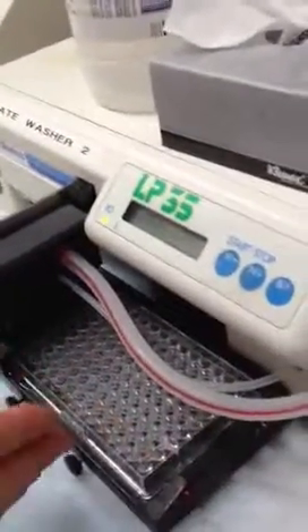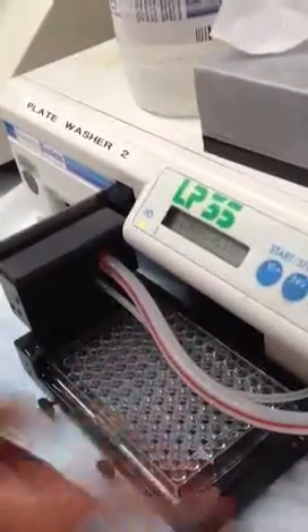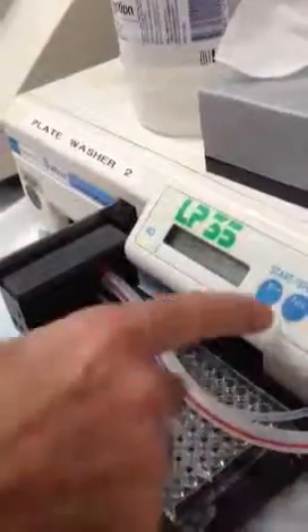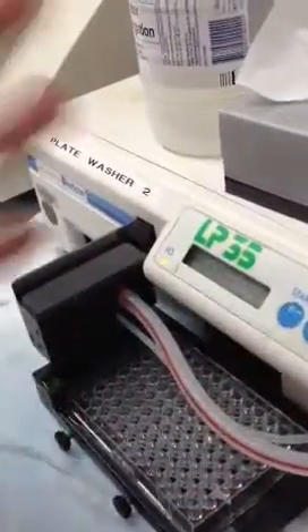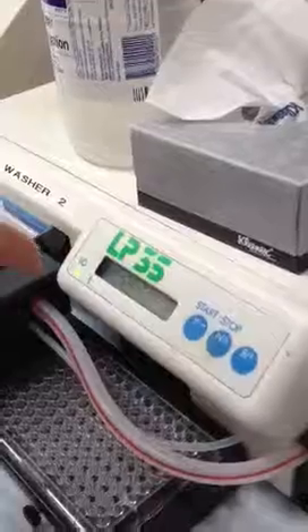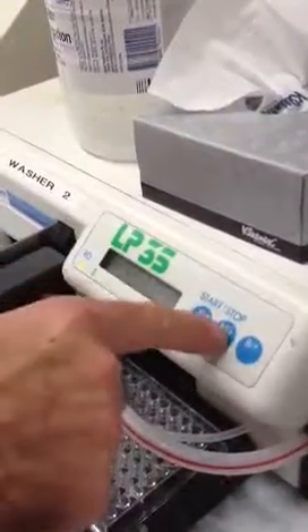If you've got a full plate, it doesn't matter how many strips you set. But if you've only got partial strips, make sure you set it — otherwise you're just wasting time and buffer. I'm going to say 12 strips because we usually run full plates. At this stage you can escape, but on the other side you can't escape.